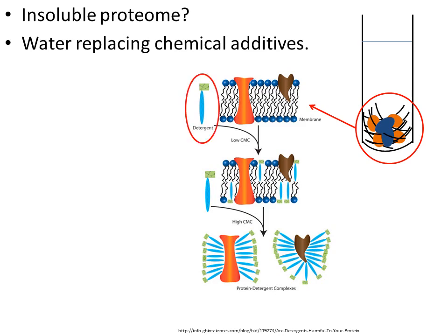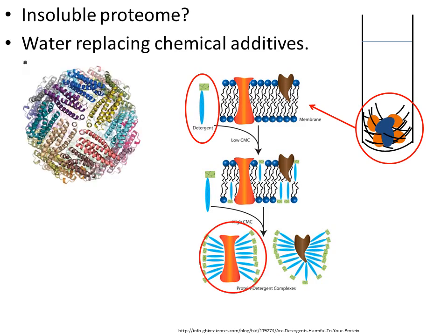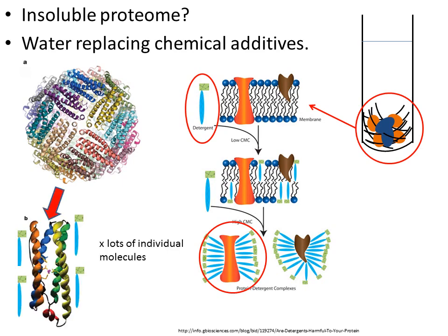Thankfully, there are a great number of additives that can be used, but great care and planning must be used because some of these additives are not compatible with some fractionation techniques, while others can interfere with downstream analysis. It needs to be noted that proteins often exist as complexes, where numerous molecules of the same or different proteins come together to execute their function. These complexes can fall apart or dissociate if certain chemical additives are present, such as these surfactants. Again, careful planning is necessary.